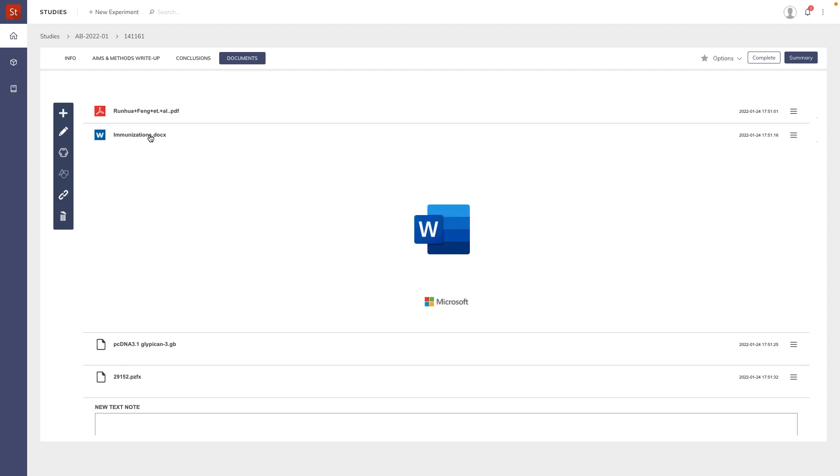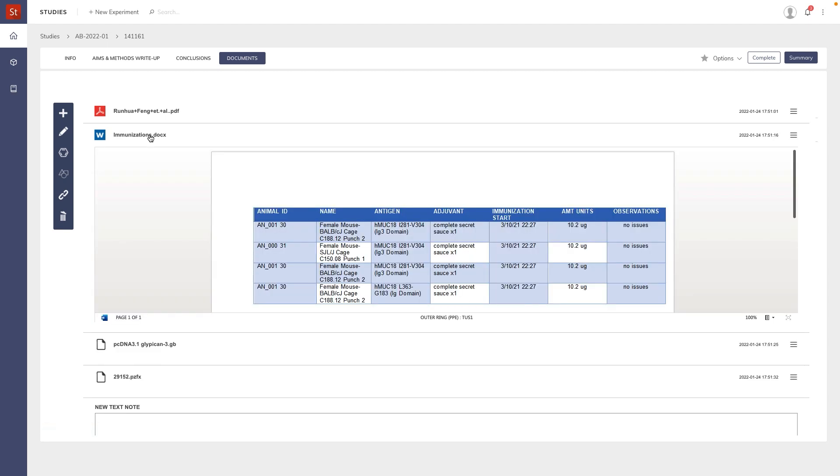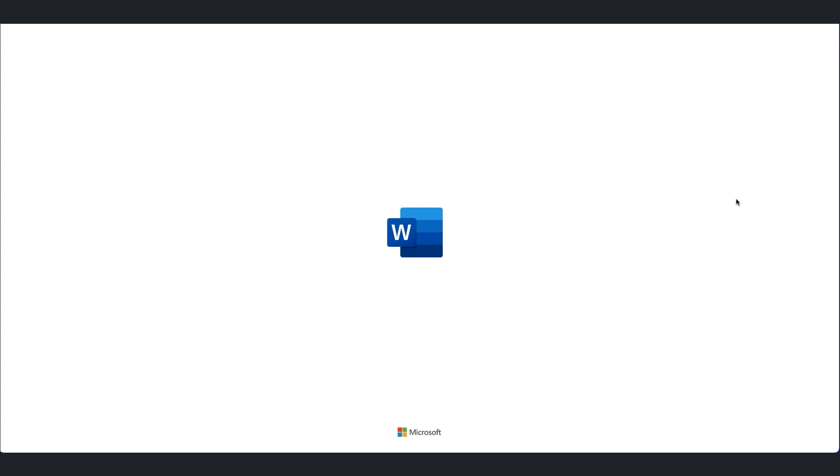So for the Word document, for example, you're now seeing a preview using Office 365. For those of you not on the cloud, you would see a simple inline document preview. To edit a document we simply open that document.